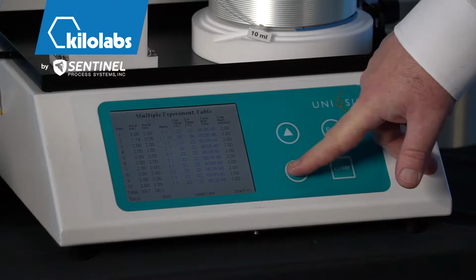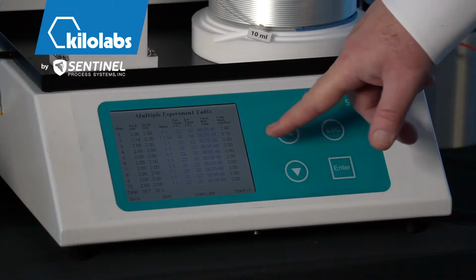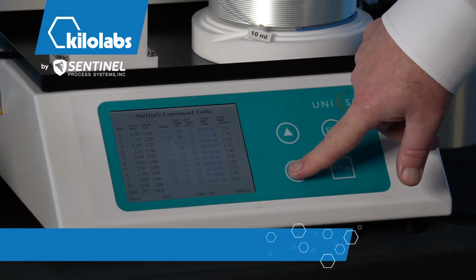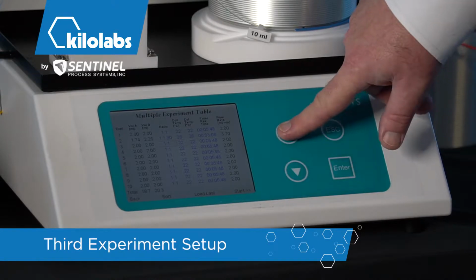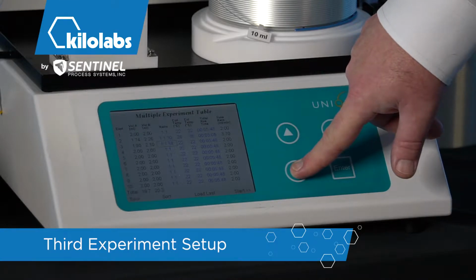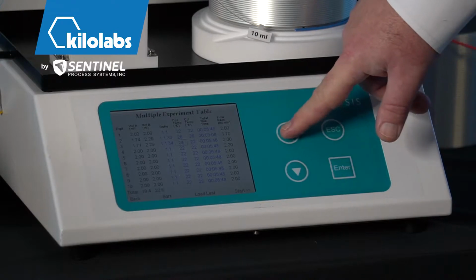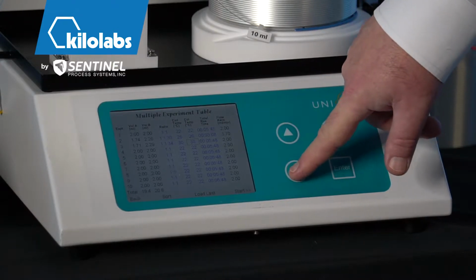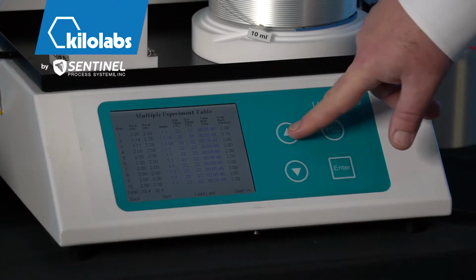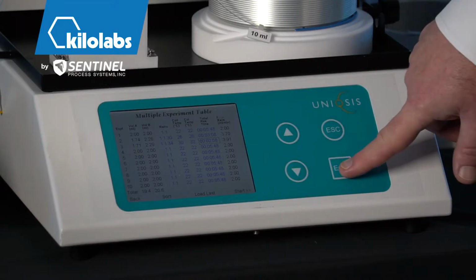Let's say I want that residence time to be something different. I want it to be less than that, 3 minutes. So that's going to automatically change the flow rate. With that, I can then go to the third experiment, change its ratio, and actually let's go in the other direction for this one. I'm just arbitrarily changing the ratio, changing the temperature, setting a different temperature just so you can see, 32 degrees, and then a different residence time. So we'll change this down to, say, 2 minutes to get the flow really high for this third experiment.